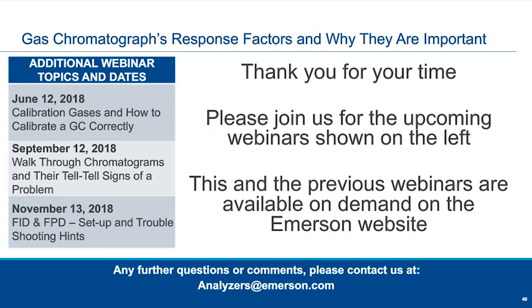So we can do that. Definitely, that's something you want to contact your Emerson field guy about, but we definitely can do it, and we actually do somewhat on a relative basis. I should also say it does depend on the concentration level. We'd expect you'd have to be above 3 ppm for us to be able to detect it with a TCD.